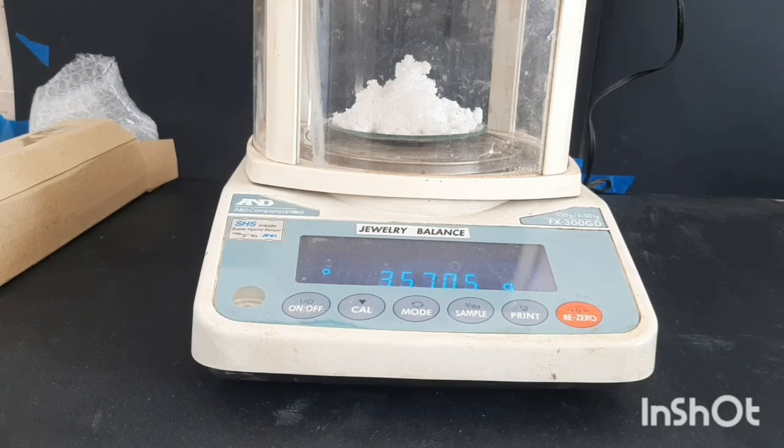He also didn't get good yield and purity, mostly because he used low-grade reagents with unknown impurities. During the reaction, he experienced a runaway reaction that he had to control by using an ice bath. That was not mentioned in the paper also. So I decided to try and make adipic acid using higher purity reagents to see if the process is worth considering as an industrial alternative.